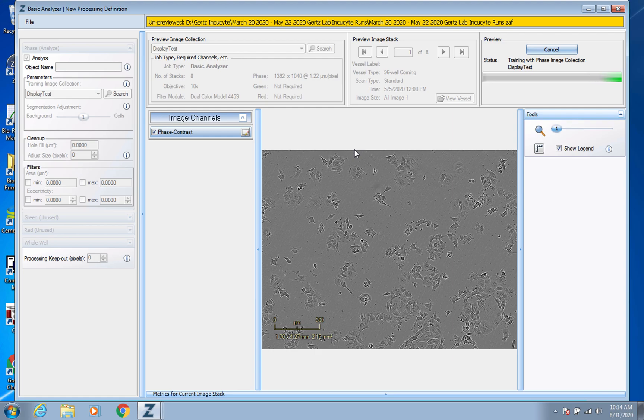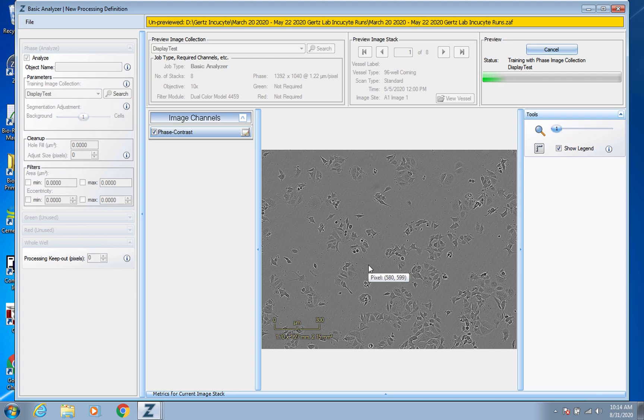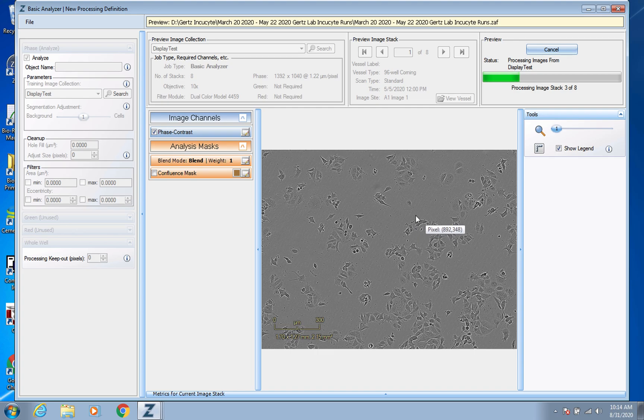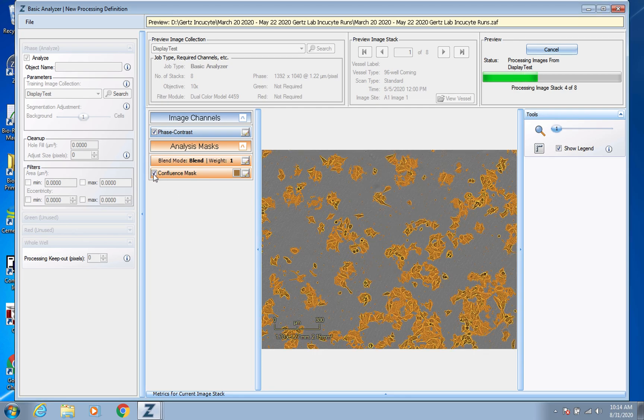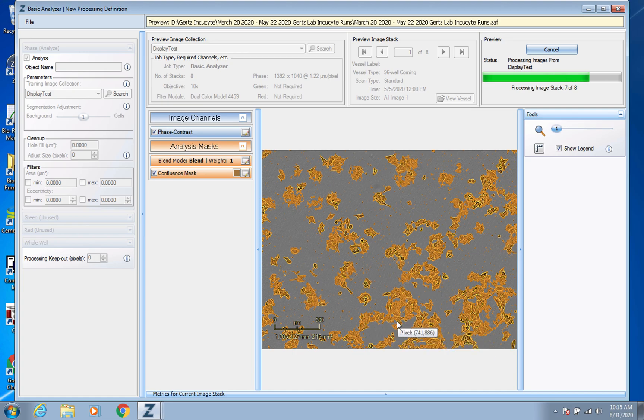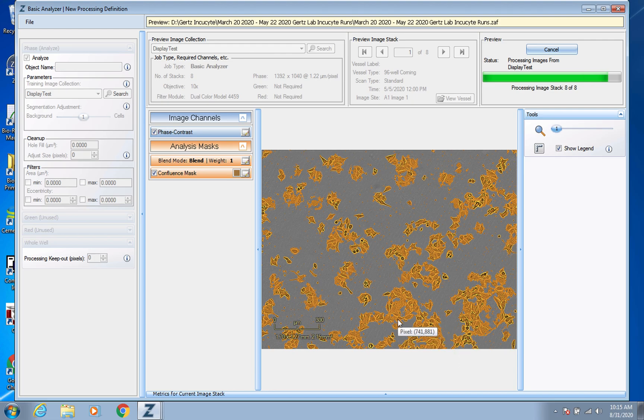And so it's looking at all those images and already training itself on an algorithm to detect those cells. And so what it'll do is use that algorithm, use this processing definition to create those confluency masks that it lays over the cells. And so I can already show you one of those now. If you click on that, that indicates to you what it is detecting as cells and basing its determination of the confluence percentage on.